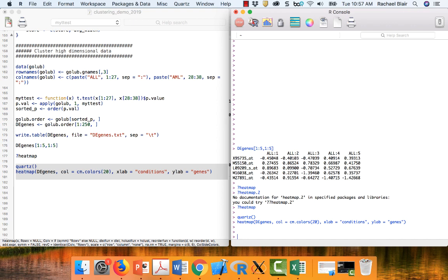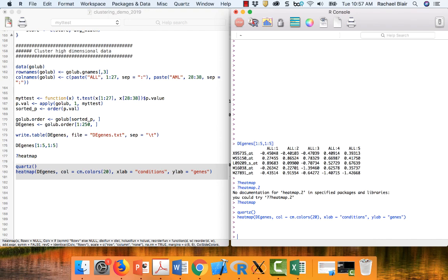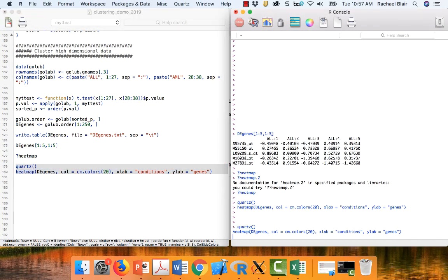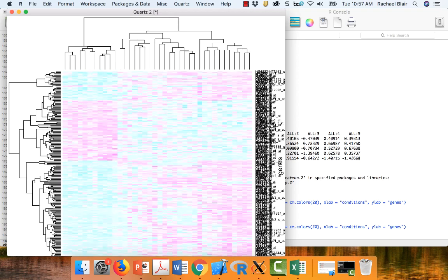Those things that are coming up at the top, which we've sorted and truncated our matrix accordingly, are the things that are changing the most because these are the ones that are separating the two means. This is the significant difference between the two means of these two groups. So if you ever stand a good chance at seeing separation between groups in data, it's going to be either through a low variance filter or by filtering on a t-test. Okay, so here we see really beautiful separation.